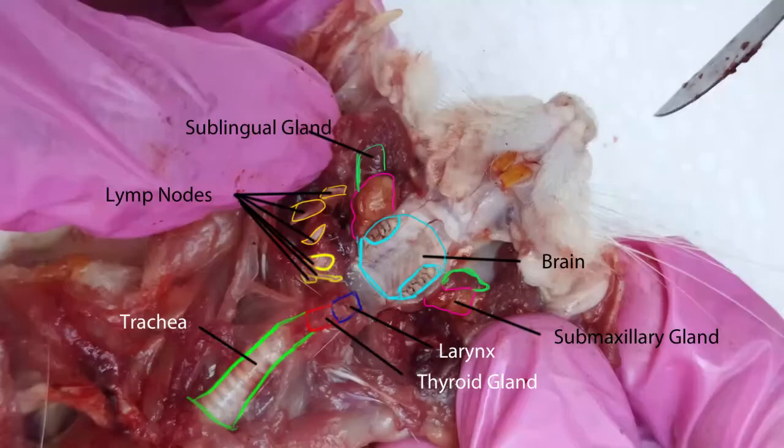The trachea is identifiable by its ring cartilage, which provides support, while the esophagus lies underneath the trachea. Larynx is the voice box and it allows rats to make squeaking noises.